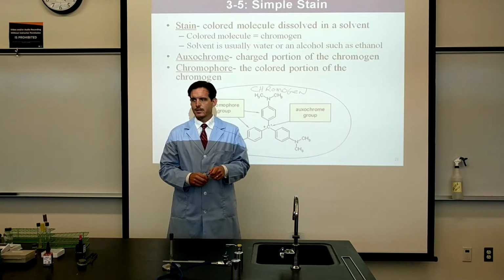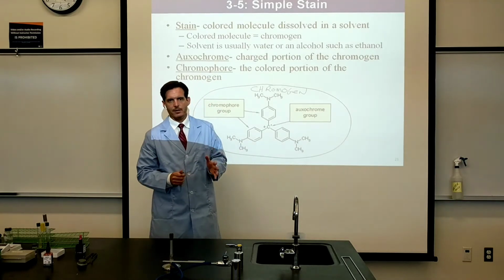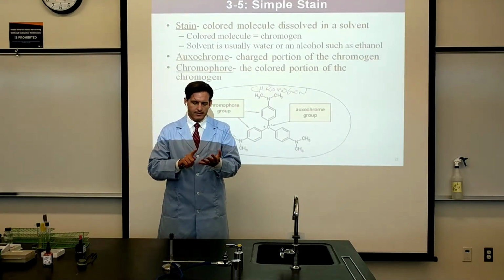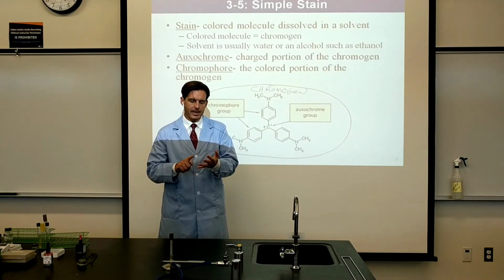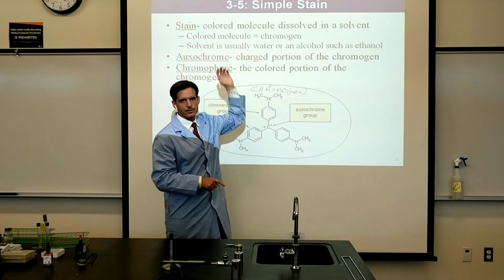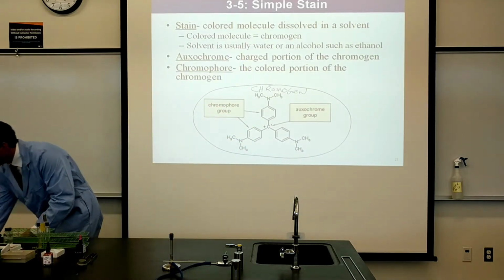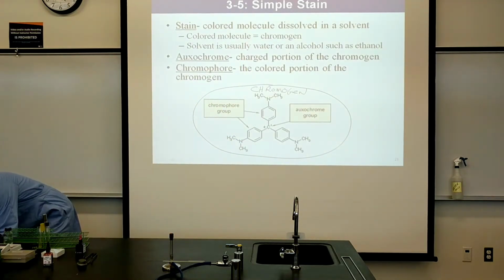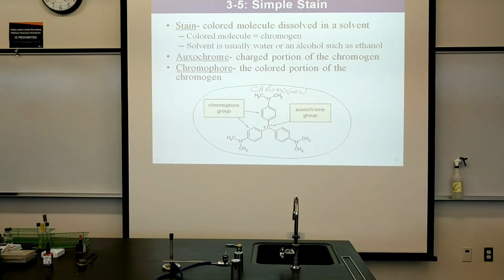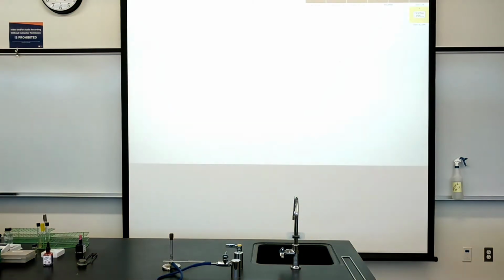If you do decide to invest the time in reading, I highly recommend that you do the reading in the theory and application sections of each experiment, like the simple stain exercise 3-5. So what I'm going to do is switch over to the document camera and read to you for just a minute or two.